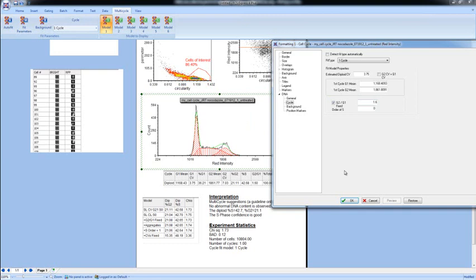Now, one common pitfall, or one thing that you should keep in mind, is that the further you get from a theoretical, mathematical model for working with biological data, the further you are from what is expected through that theory. So if you are ending up with a G2 to G1 ratio of 1 or 3 or 4, that means that your data probably isn't fitting the model accurately. In that case, you may want to go back and look at your techniques and what has gone into preparing that data. And again, if you have CVs in the 10, 20, 30, or higher range, there's a very large spread of that data, indicating that cells aren't nicely fitting into the G1 or G2 populations. So that should all be taken into account when you're working with this data.